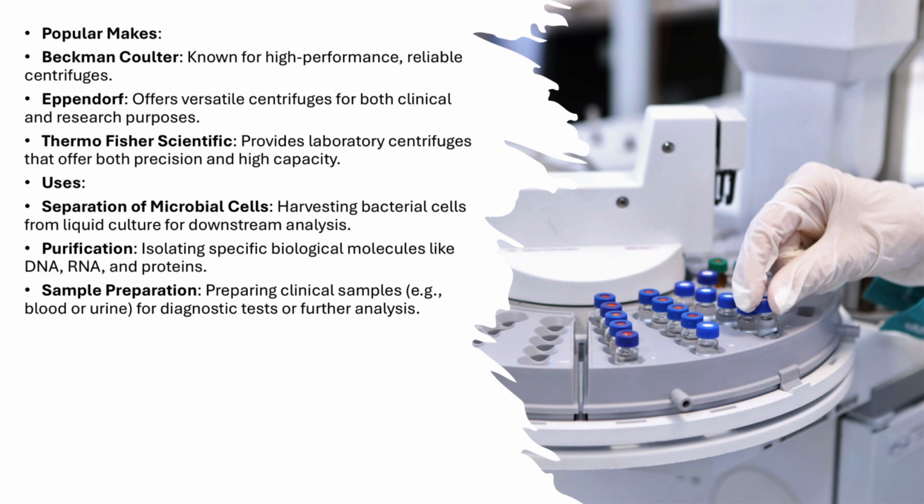Separation of microbial cells. One of the most common uses is harvesting bacterial cells from liquid cultures. After centrifugation, the bacterial cells settle at the bottom, allowing researchers to collect them for downstream analysis, such as DNA extraction or protein analysis.